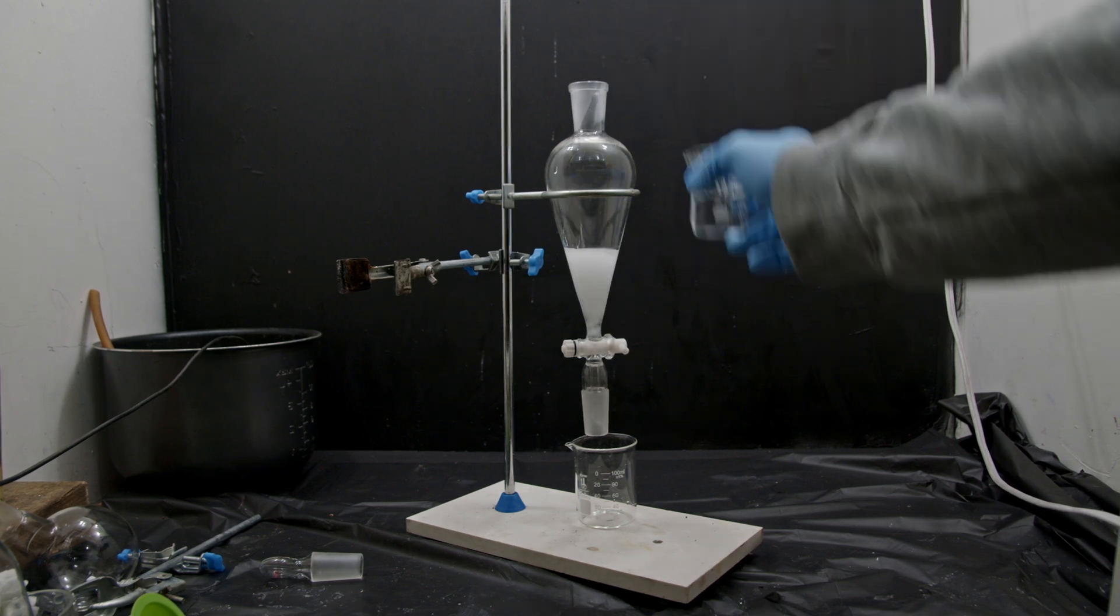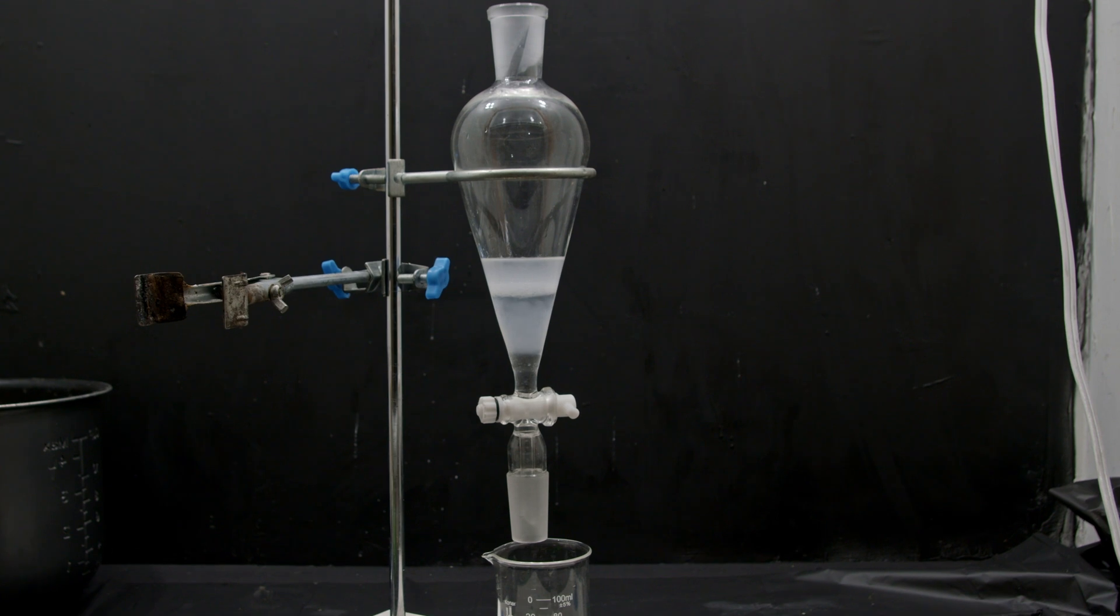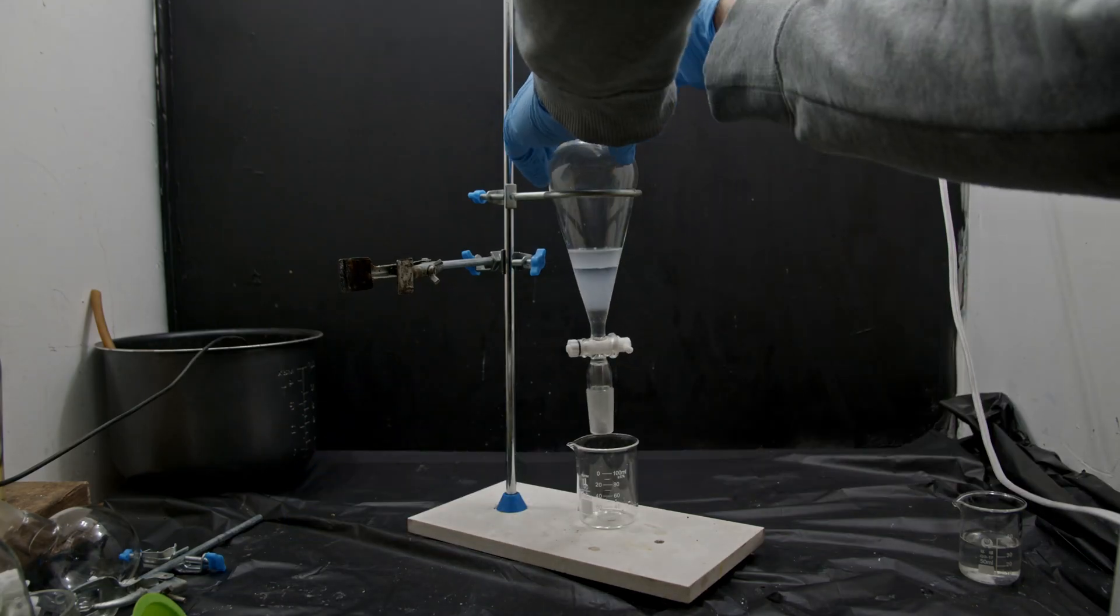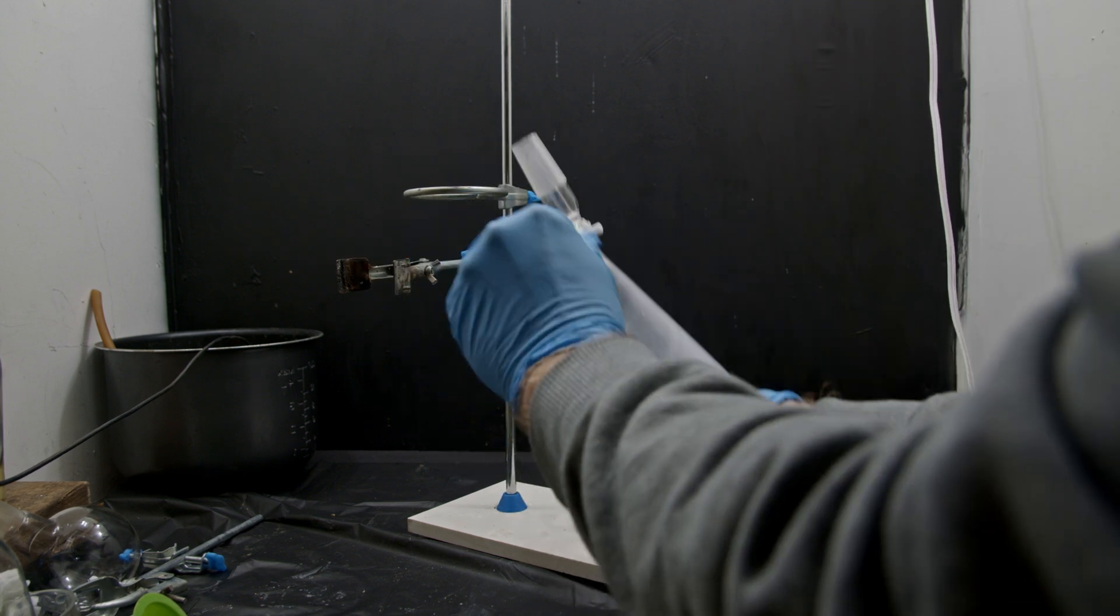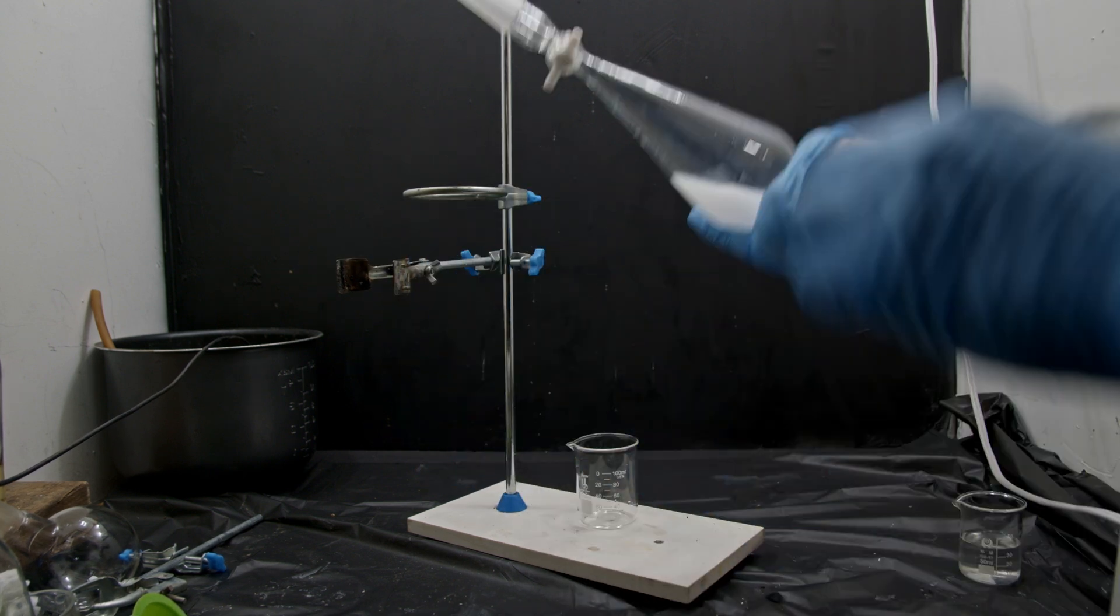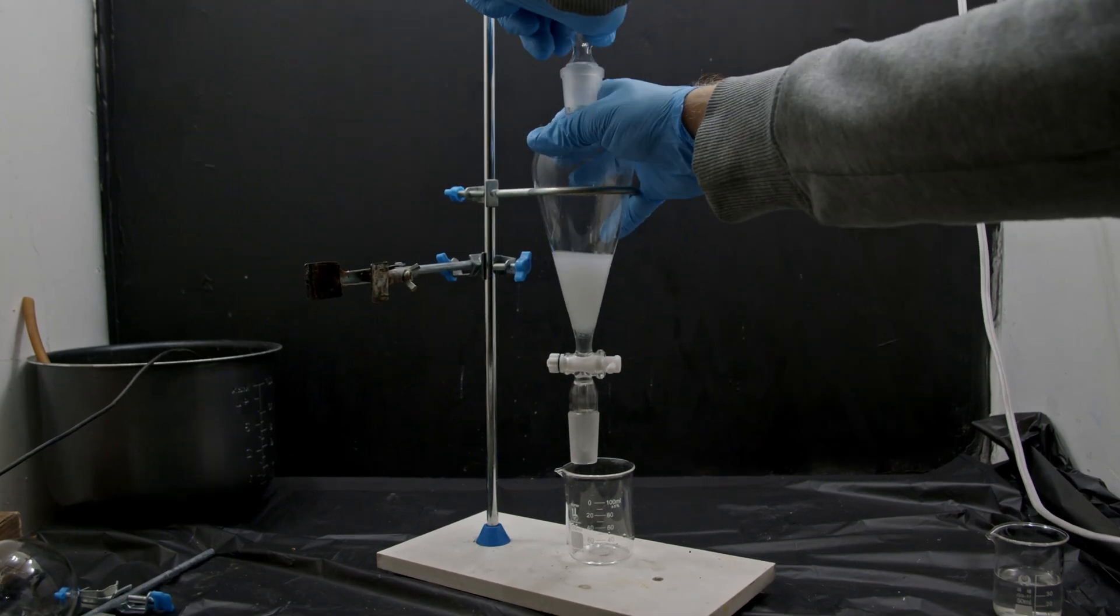We then add this to a separatory funnel with a bit of water, and you'll notice the propyl ethanoate slowly starts to float to the top, and the bottom water layer starts to collect a bit of fogginess to it. So I'll give it a shake so that it all mixes thoroughly. And you'll notice it starts to separate again.